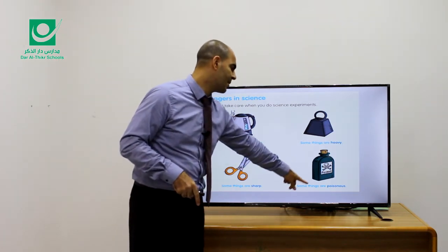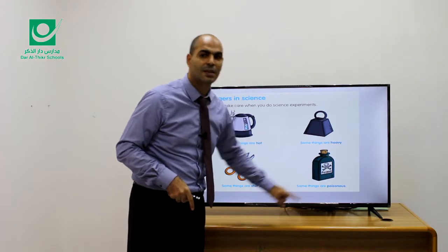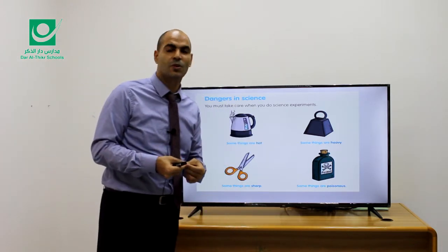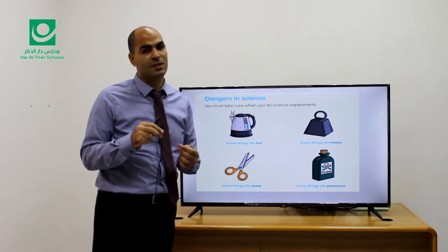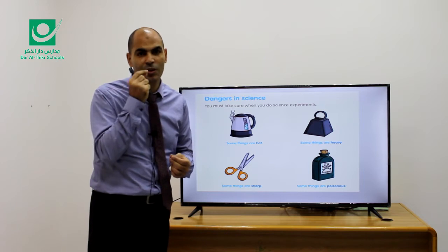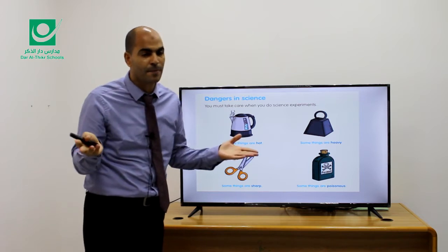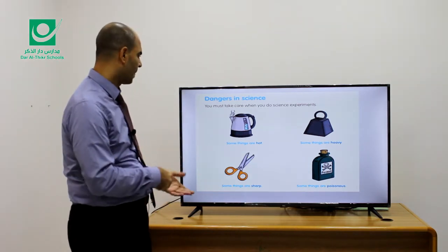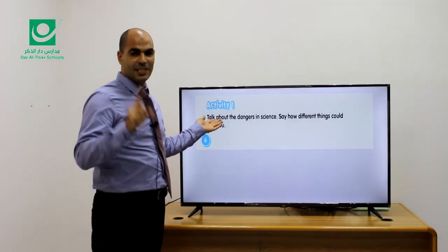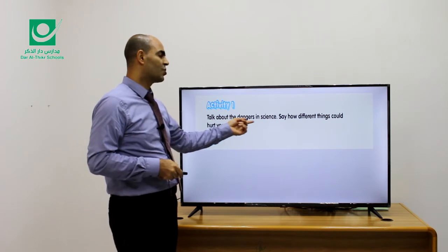Finally, some things are poisonous. In science, we use material which might be poisonous. So don't try to taste them. It will make you sick. Next, we move to activity number 1. Talk about the dangers in science.